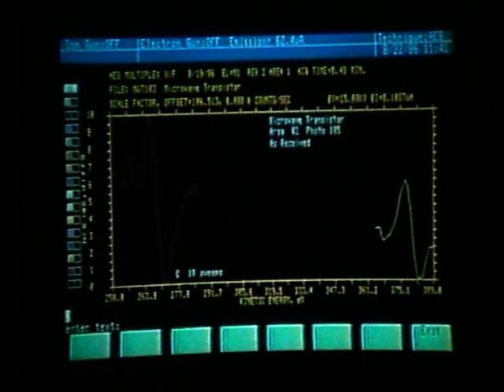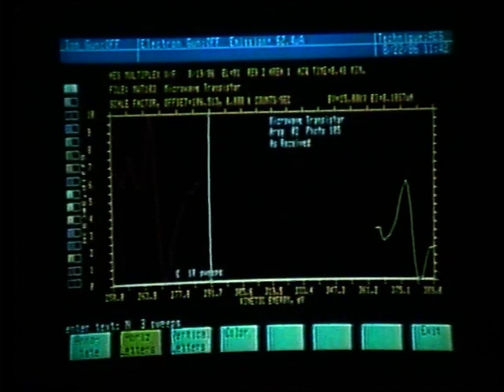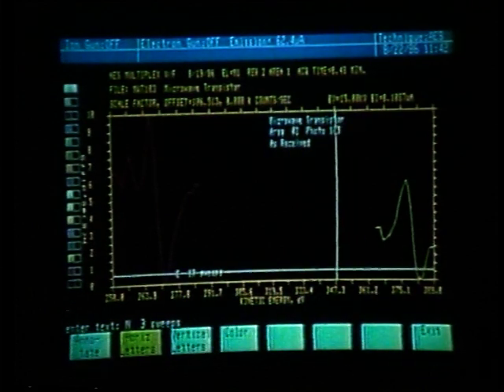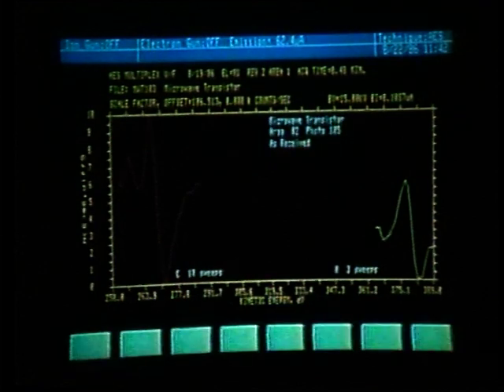And nitrogen, 3 sweeps. We can now exit the graph annotate mode and obtain a hard copy, holding the control key and print. This completes the massage section for multiplex data.